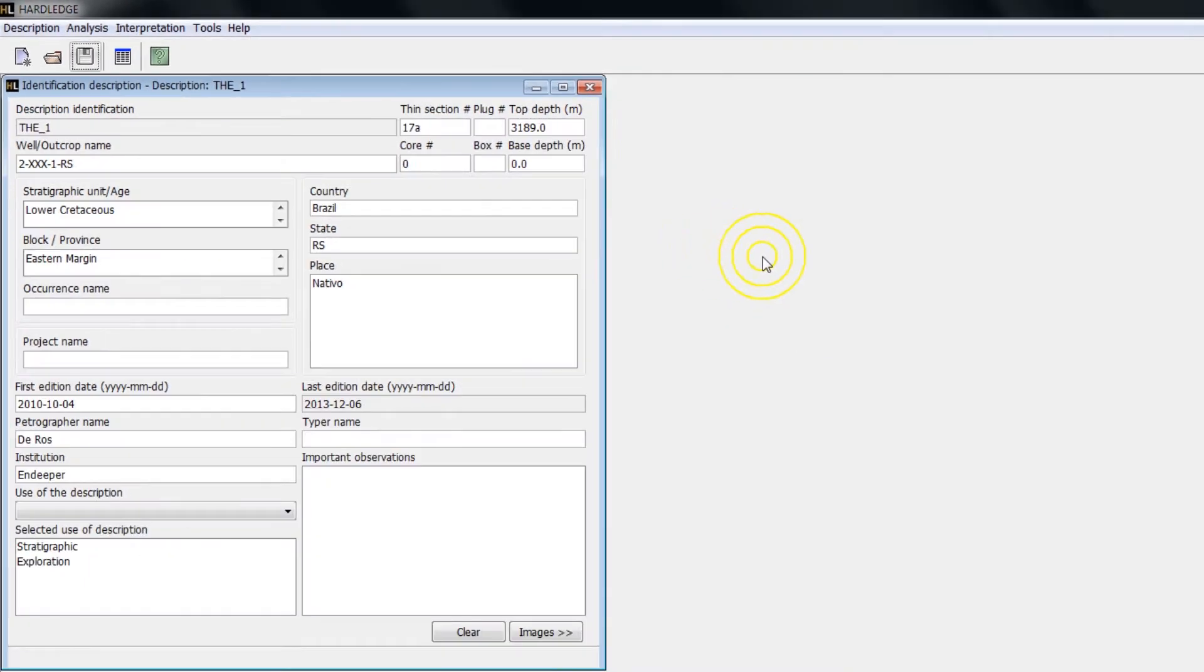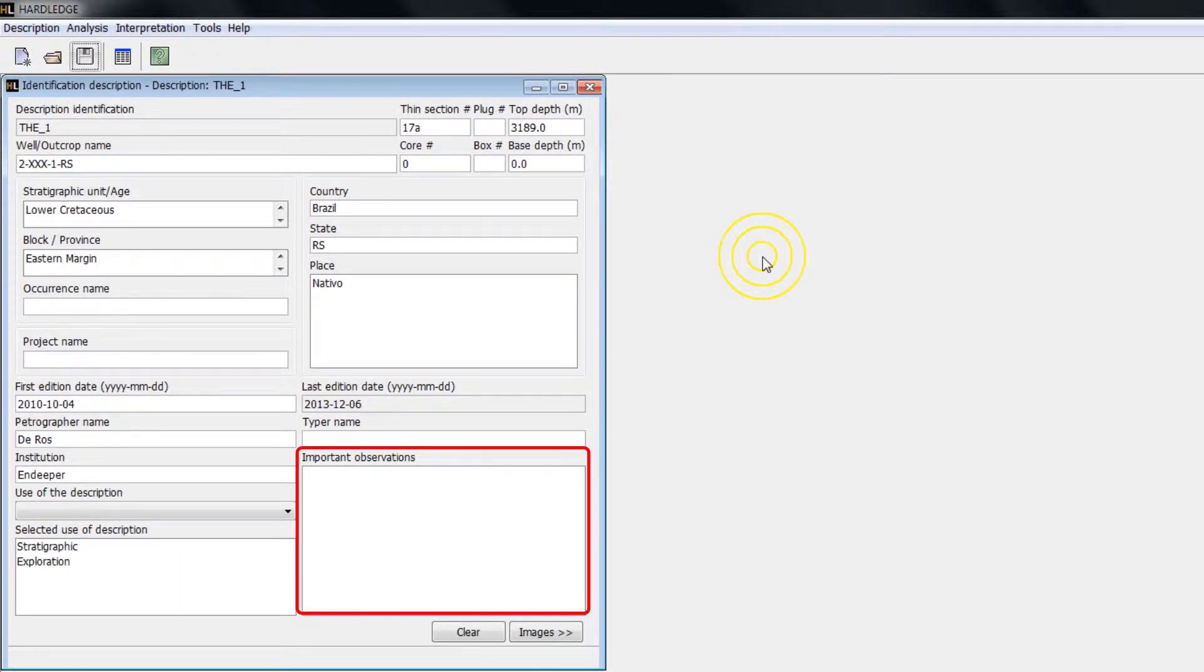Data on the location of the sample can be informed. The field Important Observations is a text annotation space where you can summarize the most important features observed in the sample, including classification, major textural characteristics, as well as primary and secondary processes and constituents.